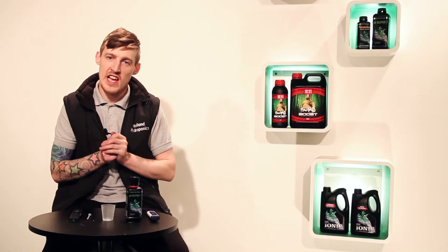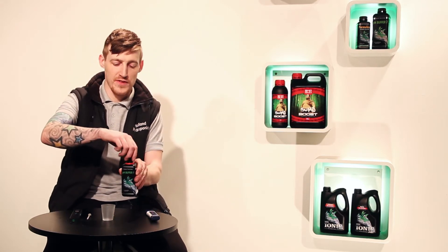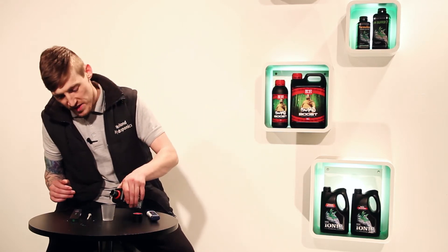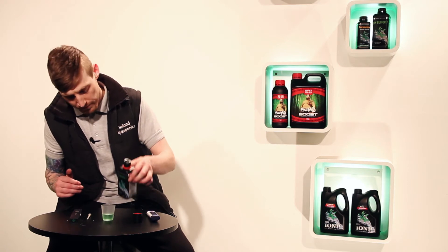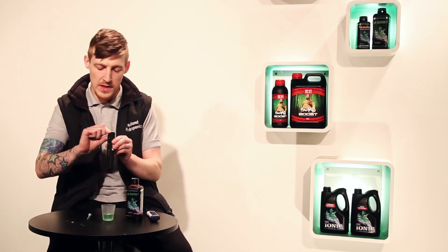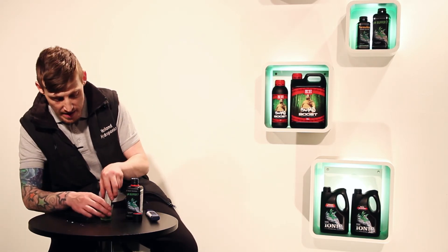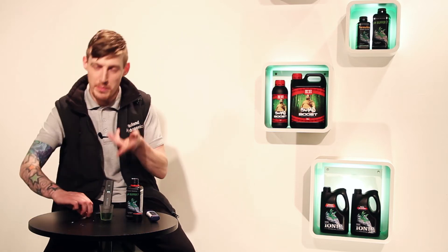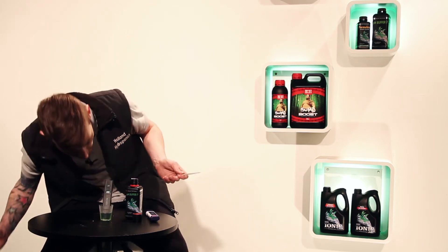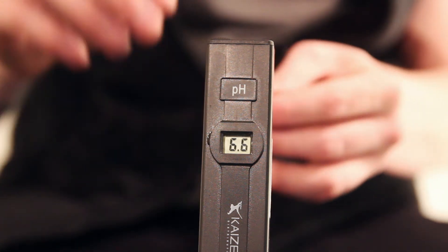All you're going to need in this next bit is your buffer 7 solution and a measuring cup. Take the lid off the buffer 7 solution, pour into the measuring cup about a quarter full. Get your pH pen, turn the power on at the top, pop the pH pen into the liquid and your pH pen will read a number. In this case, it's reading 6.6, so your target is to get up to 7.